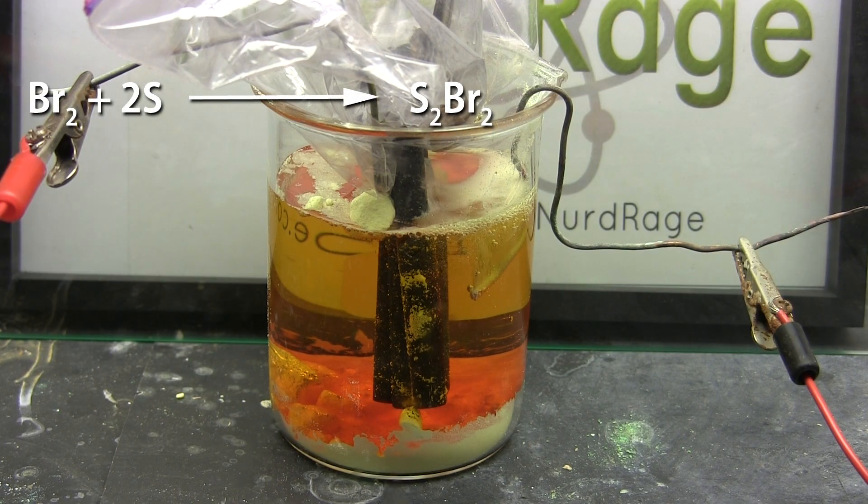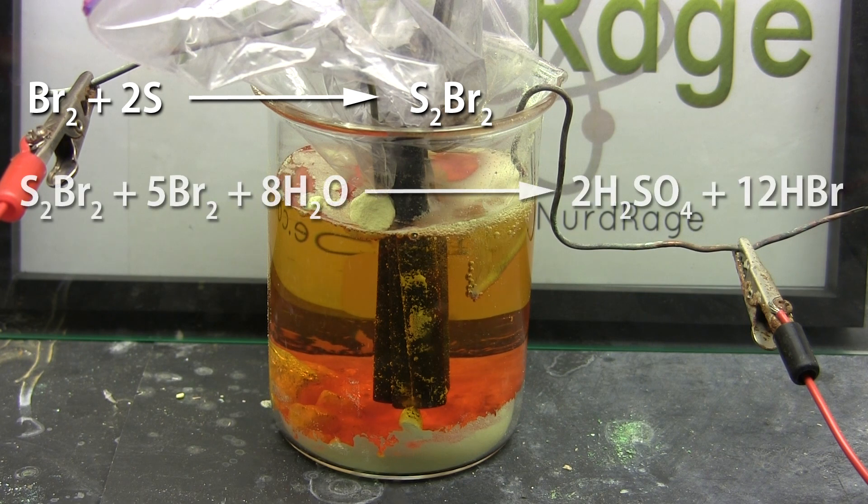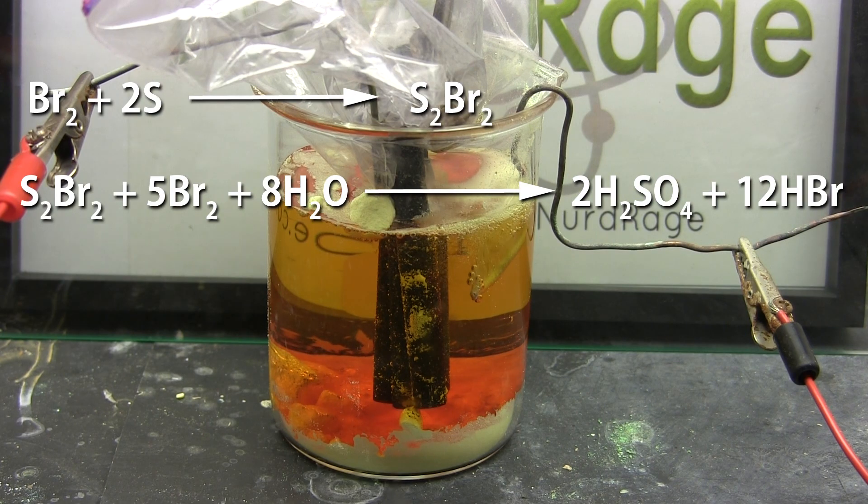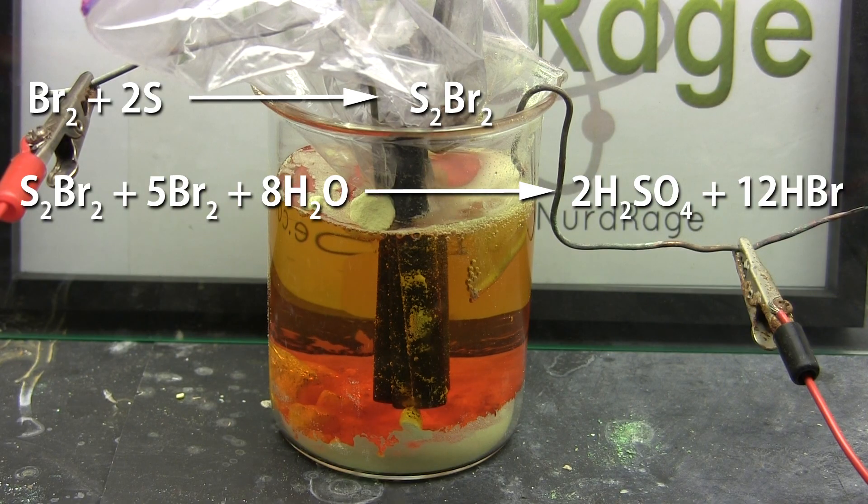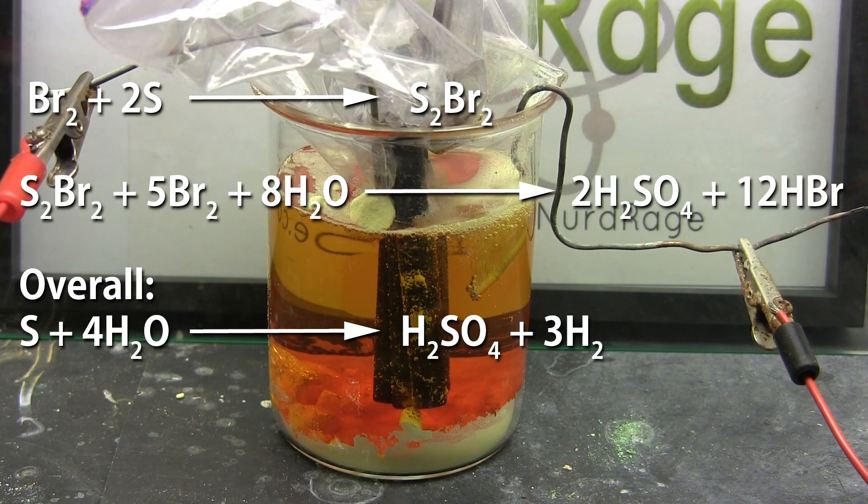The reaction is actually more complex than this with polysulfanes being produced but I won't get into that. Anyway the disulfur dibromide slowly reacts with water and more bromine to produce sulfuric acid and hydrobromic acid. The hydrobromic acid goes on for further electrolysis so it's essentially a catalyst. The overall reaction is water and sulfur producing hydrogen and sulfuric acid.